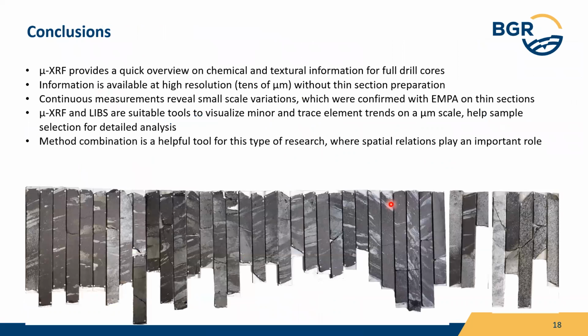So to conclude here, we can say that the microXRF provides a quick overview on chemical and also textural information for full drill cores. The information is available at high resolution, speaking of tens of micrometers, and even without thin section preparation. And the continuous measurements with tens of micrometer resolution reveal small scale variations, which we could confirm with the electron microprobe on thin sections.